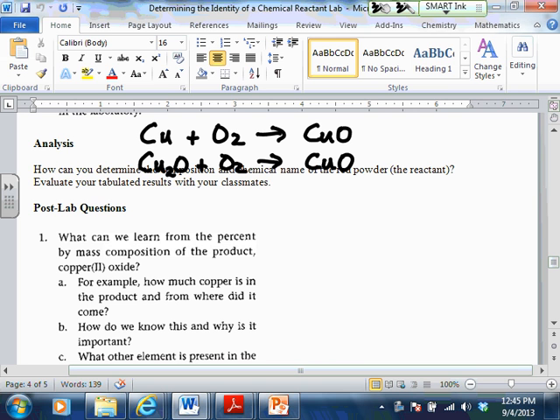Okay. The thing is, with both of these, the mass is probably going to go up, right? And I know that looks weird because Cu2O, it looks like the mass would have gone down. Okay, but if you think about it, this is copper 1 oxide, so there's only one. So it takes 2 coppers for every 1 oxygen to make the lattice there, okay? So you got to kind of think about that in terms of an ionic compound.